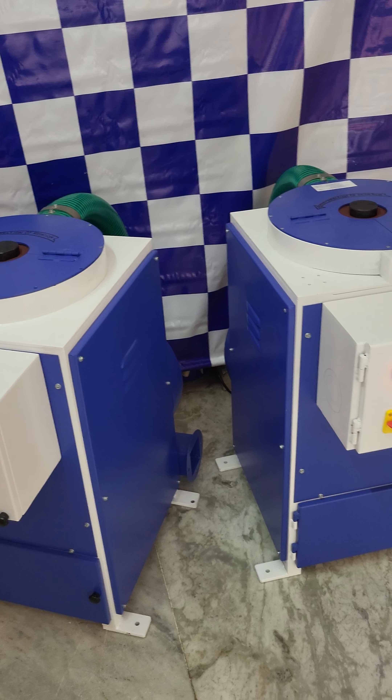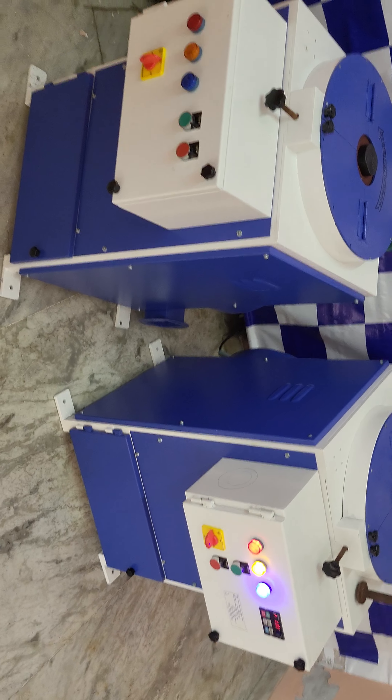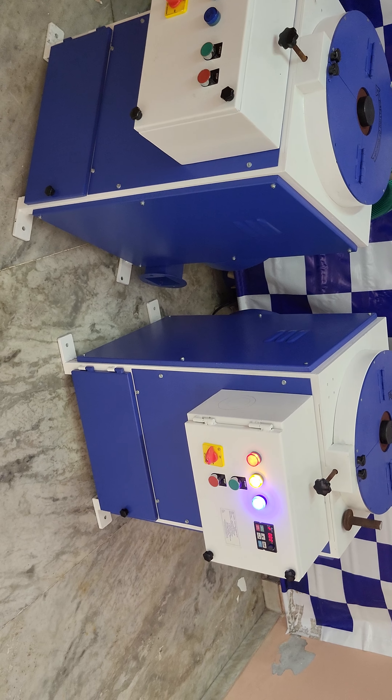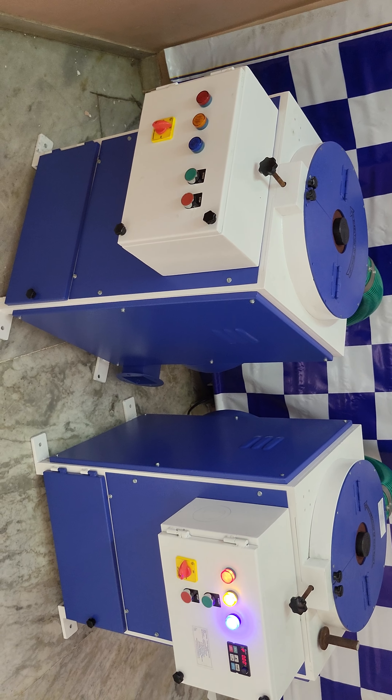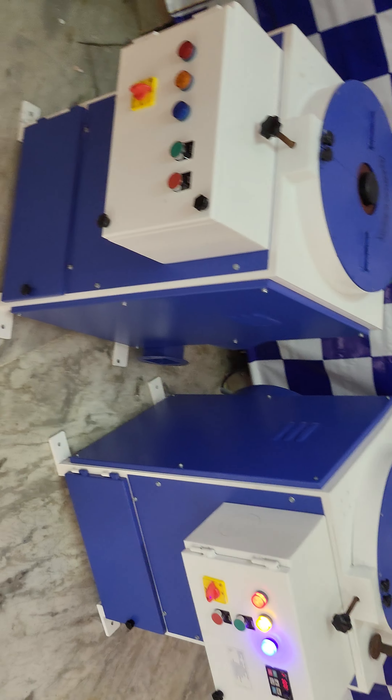Hello friends, welcome to this session. In this video we are comparing two single disc polishing machines — one is a variable speed and another is a regular fixed speed machine. The basic difference is in the specification.